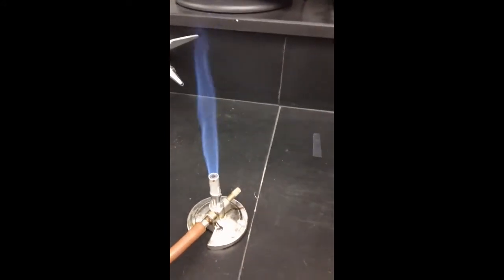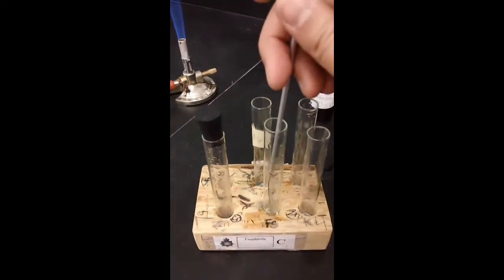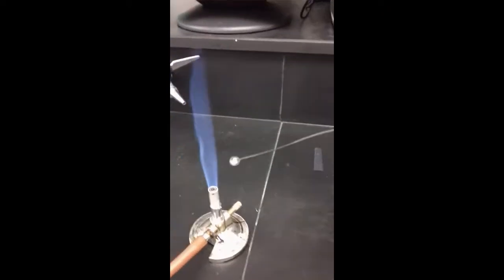Okay, so now we're going to do FE. So again, FE, this one right here. And put it in here. Make sure that we have liquid filling the loop. Okay. Oops, my bubble popped, so I gotta make sure I do it again until I have that.